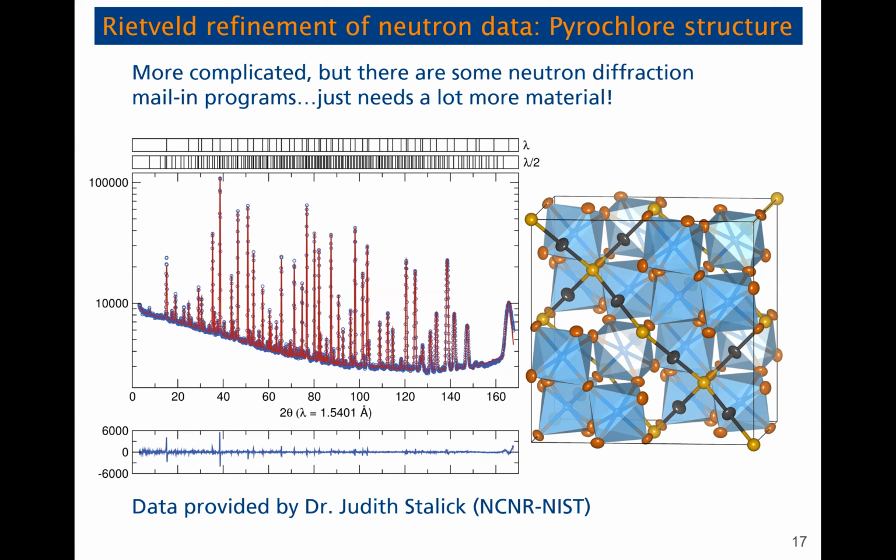In this instance, to do neutron diffraction, you need a nuclear reactor. You need a nuclear reactor to be able to generate neutrons, and generate neutrons of a very precise wavelength in the process. In your process of generating those neutrons in the nuclear reactor, you're not going to be able to generate as many neutrons as the X-rays that you generate at the synchrotron.